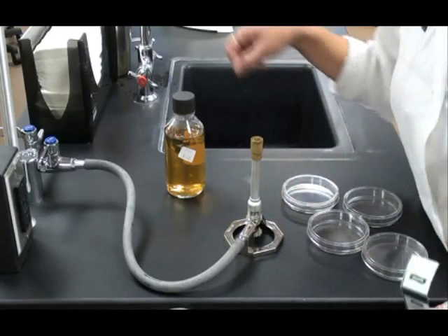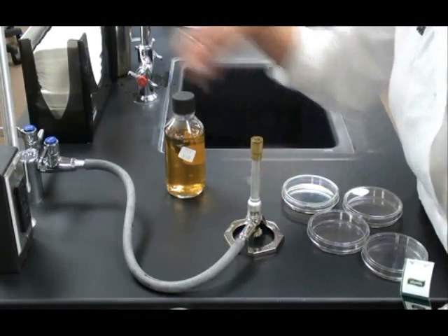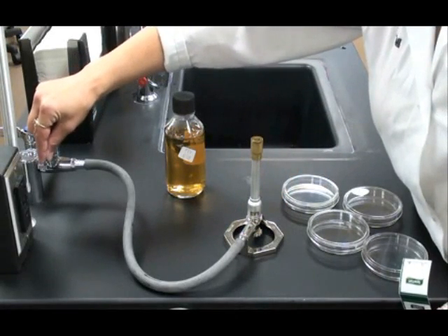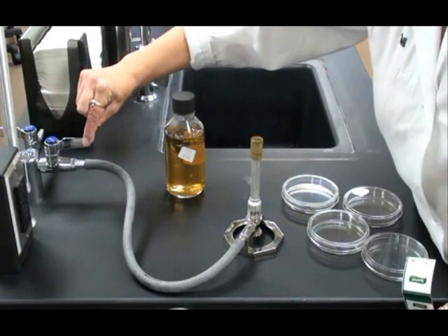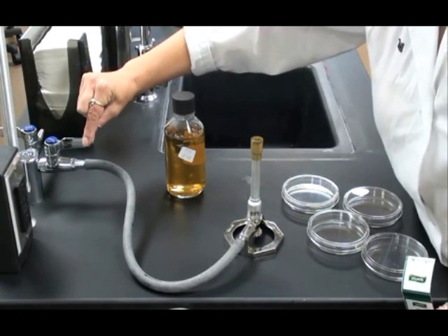To light my Bunsen burner, I make sure it's hooked up to the gas supply and then I turn the handle of the gas supply so that it's parallel with the nozzle. That means the gas is on.